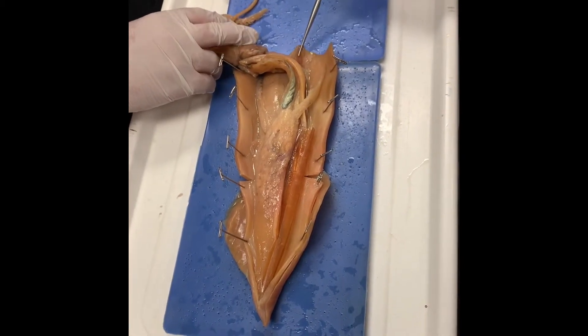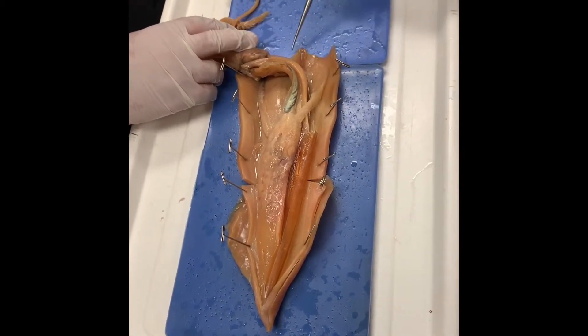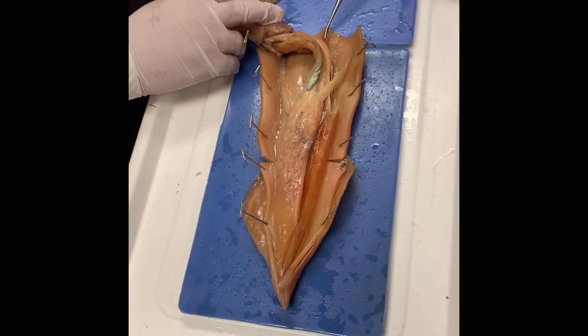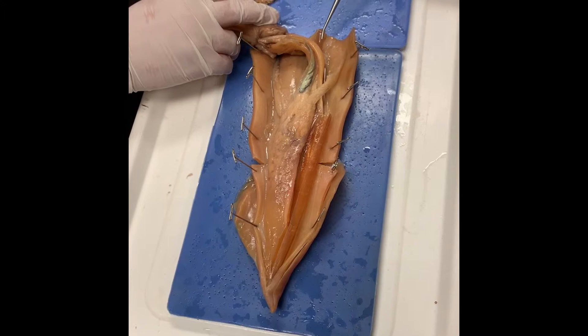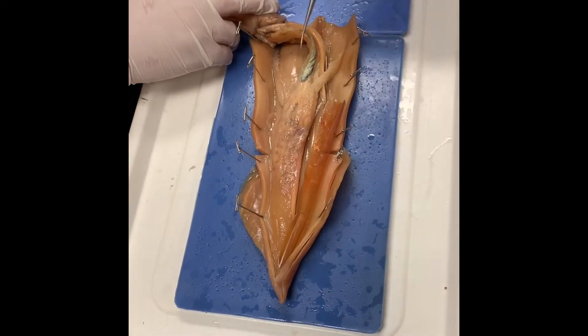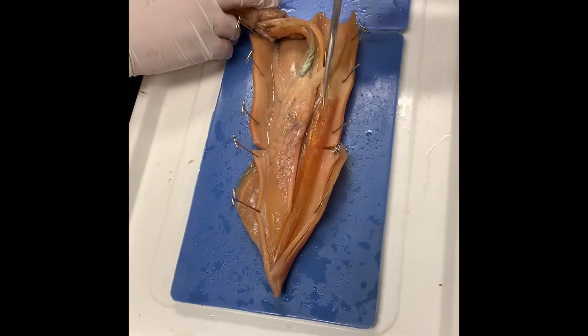The pen is the remnant of the shell. It's not really a shell anymore — it's not really providing protection as much as it is providing support, almost like a vertebral column or a backbone. It's not the same thing as our backbone, obviously, but that's the pen.